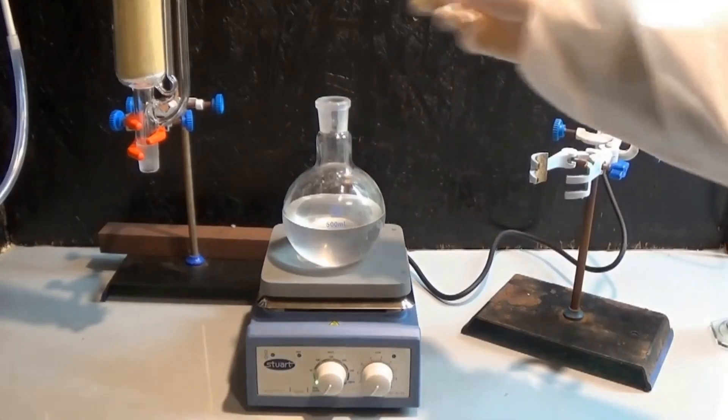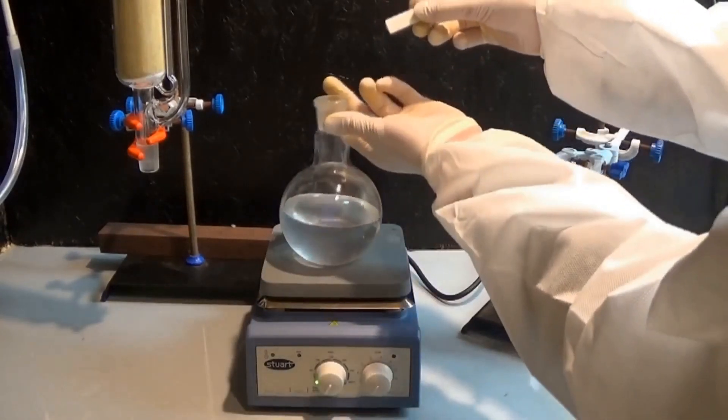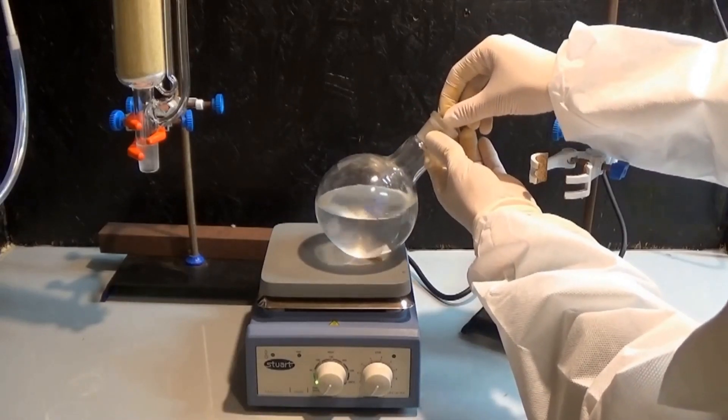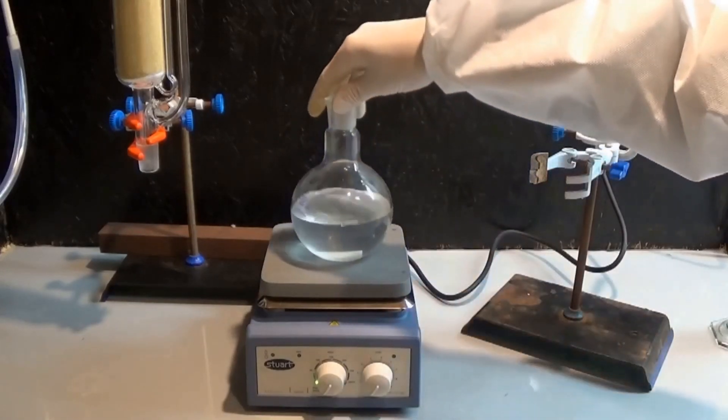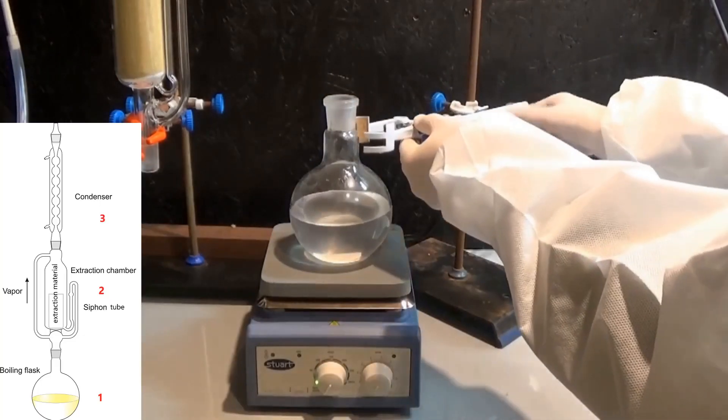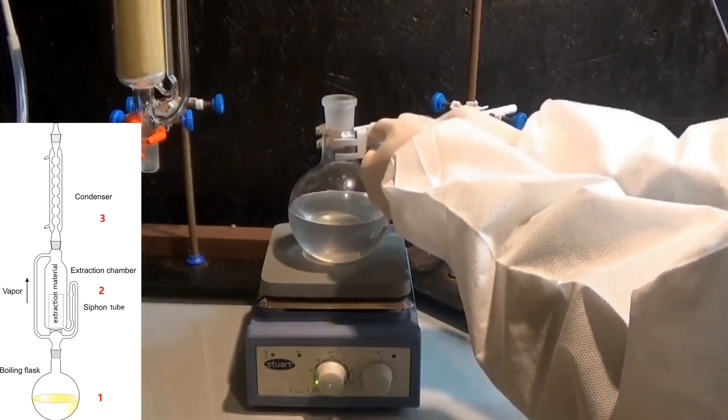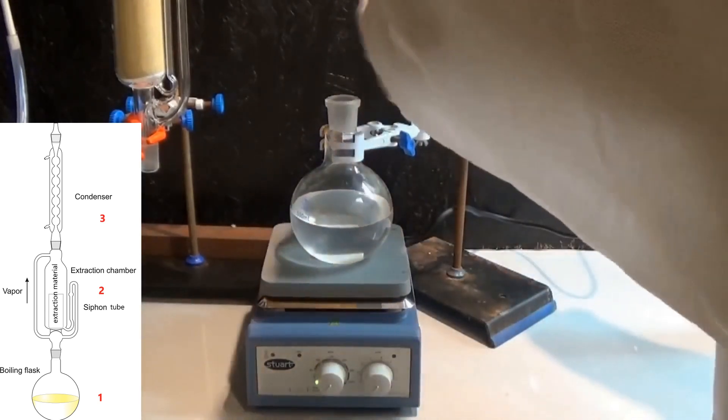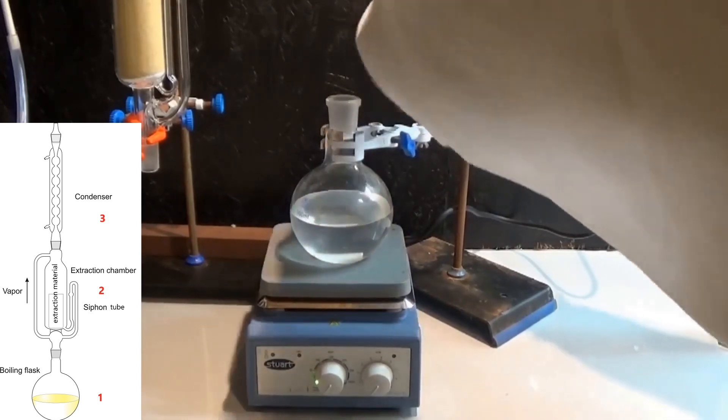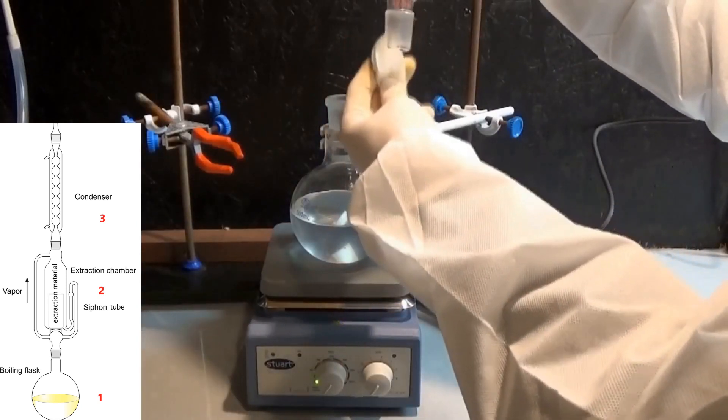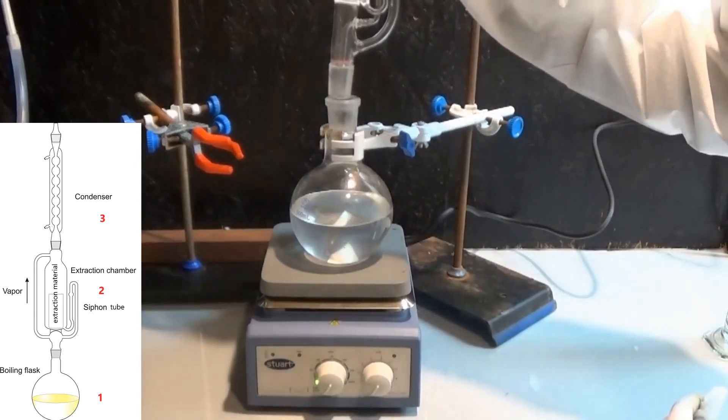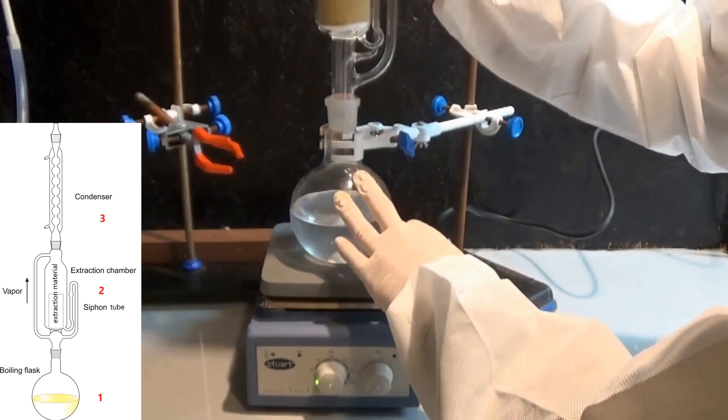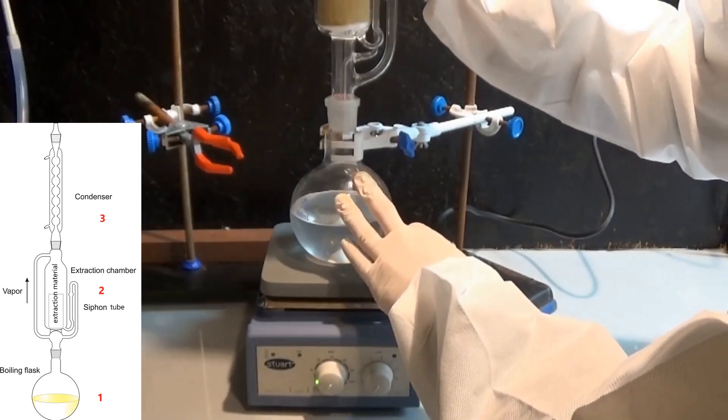So now it's time to look at how a Soxhlet extractor works. The Soxhlet extractor is divided into three parts with different functions. The first part is the boiling flask. In the boiling flask, hence the name, the solvent is brought to a boil and the solvent vapor travels upwards. The hot solvent vapor travels through the vapor tube into the second part, which is the extraction unit. There it travels up even further until it reaches the third and final part, which is the condenser.